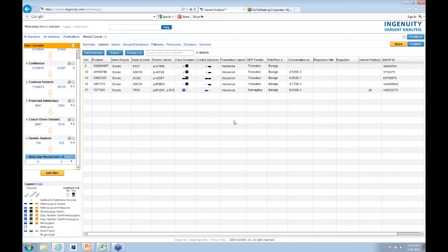Hopefully, what I've done is outline, particularly in the variant assessment section, the things that look more like artifact, the ones that carry a yellow or red flag with them. It says these are more likely to be artifact than some of these others, and there's no black and white, this is definitely artifact or not, until you go maybe resequence, Sanger sequence it or something.